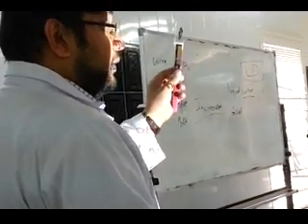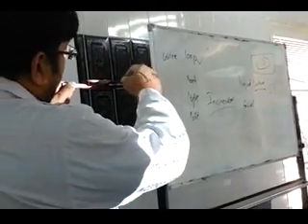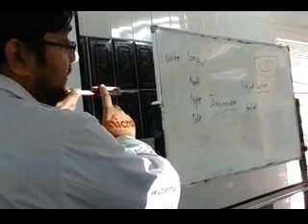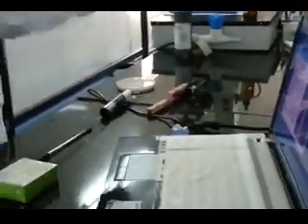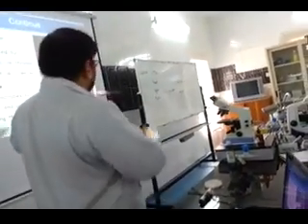For example, if I do like this, it is very difficult to judge which side it is. So always mark the side, and when you hold the forceps, put the bacteria on the smaller edge. This small side, put the bacteria. So always you remember that this side you have bacteria, and this can stand also when you stain. Okay? You get this point? Yes. Okay.